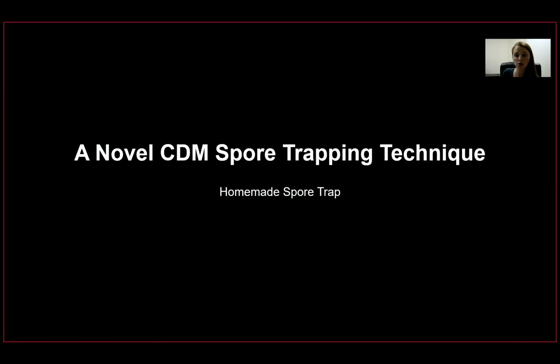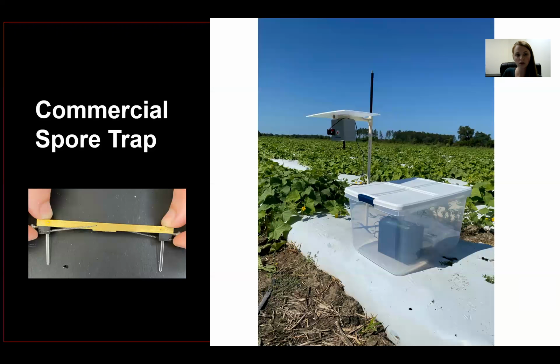In order to increase our collection of downy mildew, we have developed a novel cucurbit downy mildew spore trapping technique, which I would like to introduce now. First, let's look at a commercial spore trap.